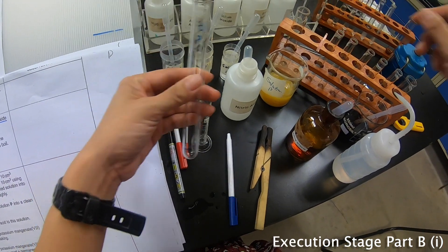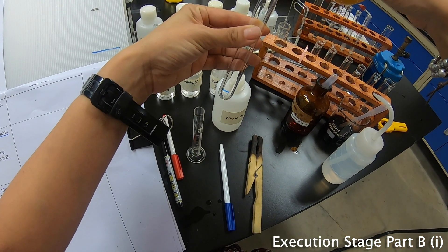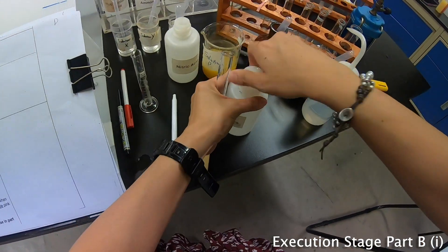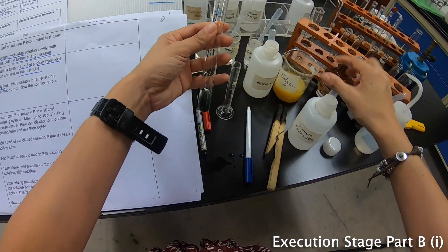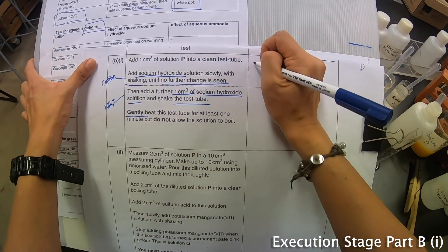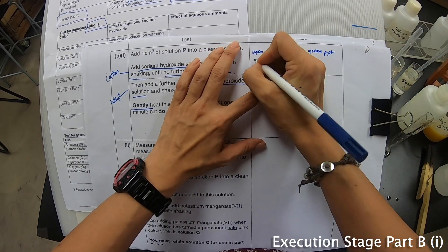So first of all we'll add about 1 cm³ of P into the test tube. I can immediately see that it changed to a dirty green precipitate. It's a dirty green precipitate, so I'll put this back and quickly write down: upon adding NaOH, a green precipitate is observed.